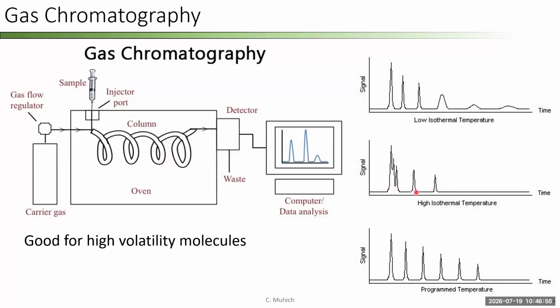So if we look down here at this higher oven temperature, we have 1, 2, 3, 4, 5 peaks. So we're missing that sixth peak. But in exchange for that, we get much shorter time frames. What's really happening is all of these peaks are getting squished, and you can see if I squish this one down, it might merge with this first peak.